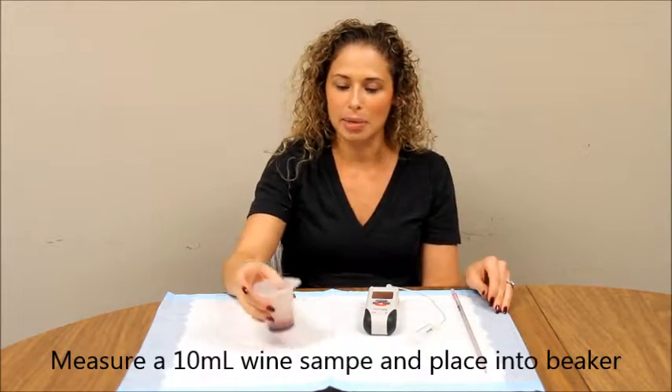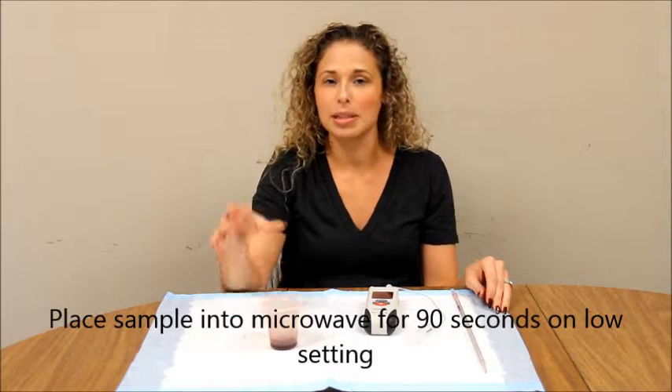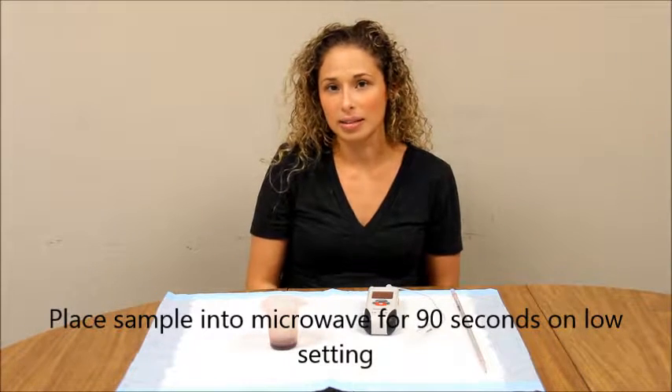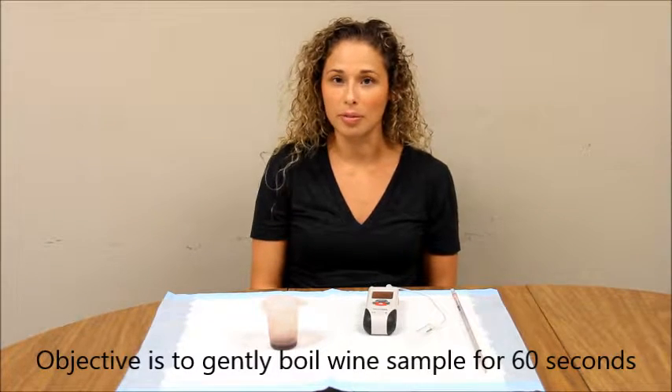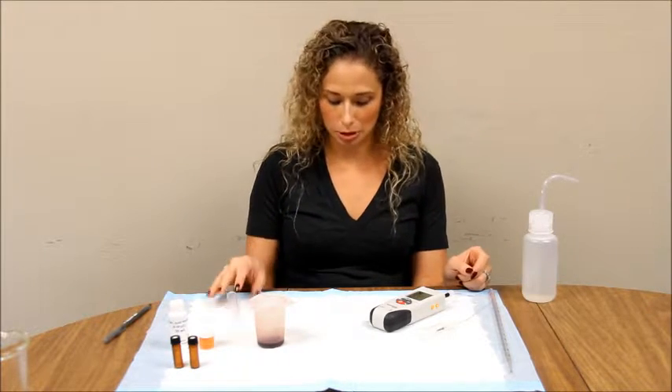I just took 10ml of my wine sample and placed it in my 100ml plastic beaker. I'm now going to put it in the microwave for 90 seconds. The objective of this is to allow the sample of wine to boil for about 60 seconds. The sample has now cooled to room temperature.